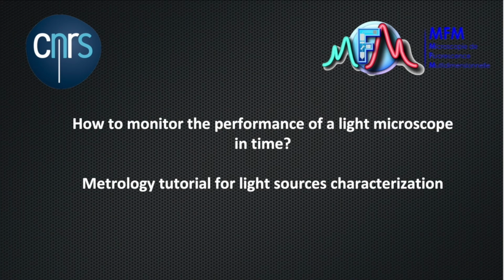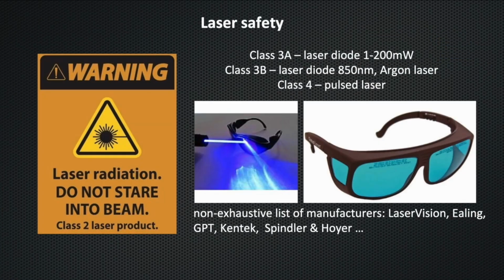How to measure the power of an excitation source in light microscopy. How to follow its evolution over time. What is the source stability? How to measure and analyze it. We propose to answer these questions for conventional microscopy setups as wide-field, confocal, and spinning disk microscopes.